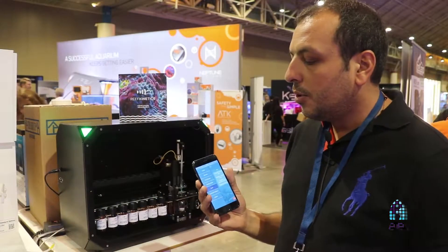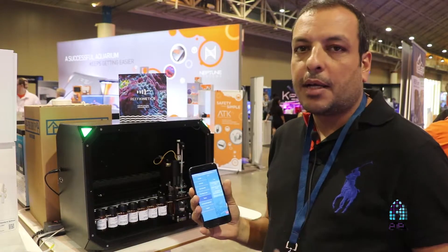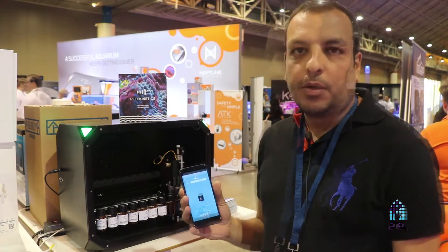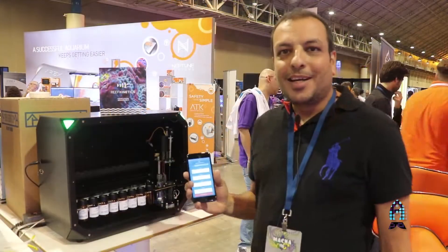You can also add devices to the same account if you have many devices, and test now of course. All the maintenance it needs is to change the syringe monthly or every two months, depending on how much testing you do. Thank you again.